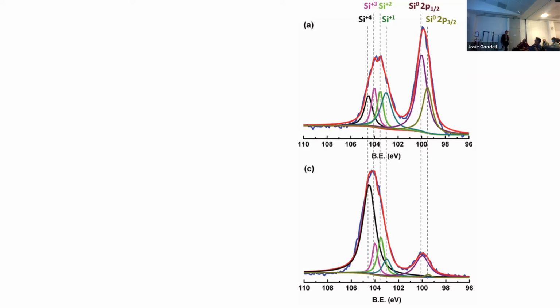I would do the same, but then you also add more peaks, right? Of which you don't really know the location. No, but they're constrained. You know the spin orbit splitting. You can constrain the separation, constrain the shape to be the same. Completely constrained. But you need to end up with a symmetric peak, right? So you need at least several doublets to get a symmetric peak.